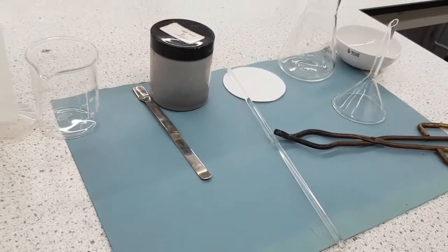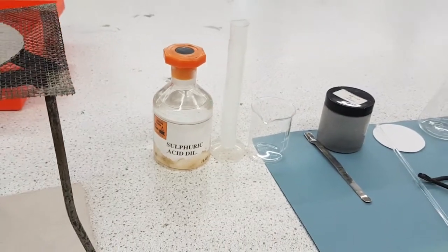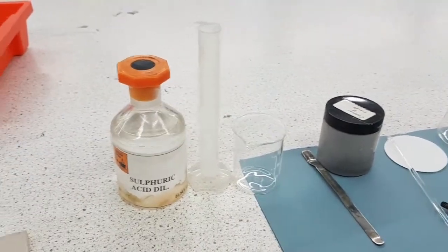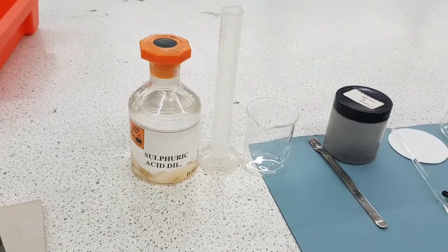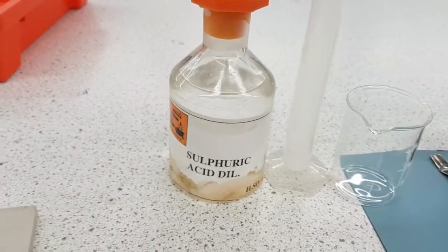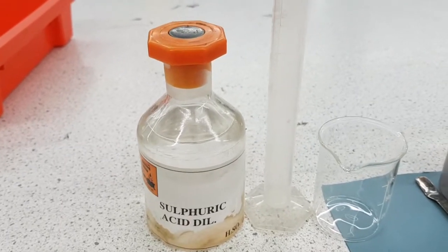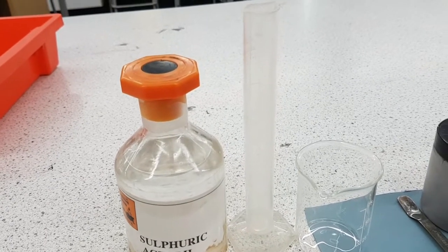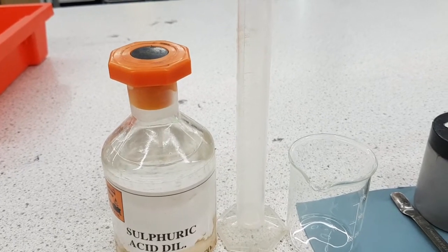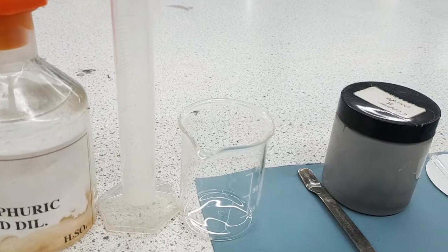Obviously because we're handling chemicals we need to make sure that we've got our goggles on at all times. In terms of the procedure, number one: you're going to use a pipette to take the sulphuric acid and add 20 ml of sulphuric acid into your measuring cylinder, then transfer that into your beaker.